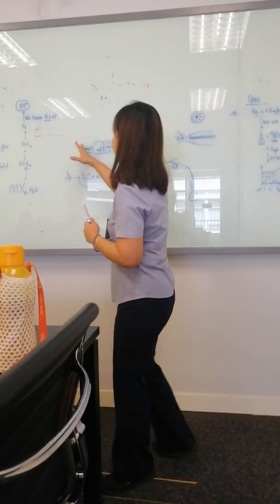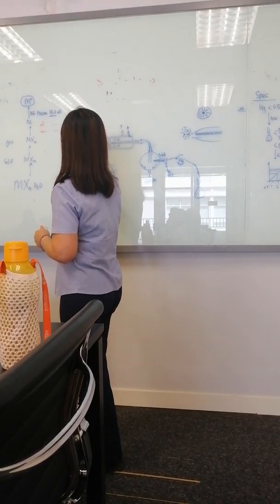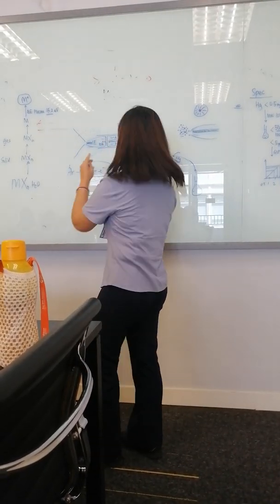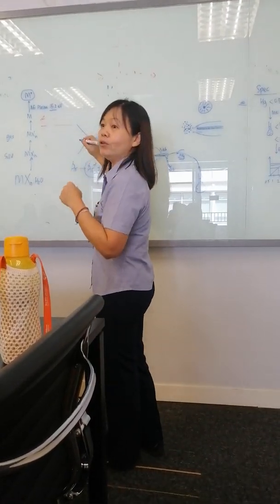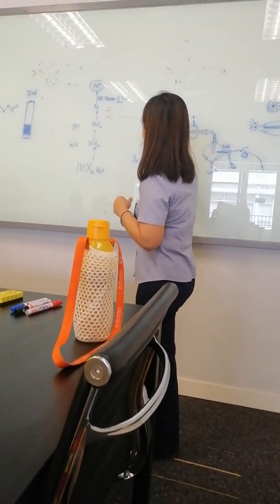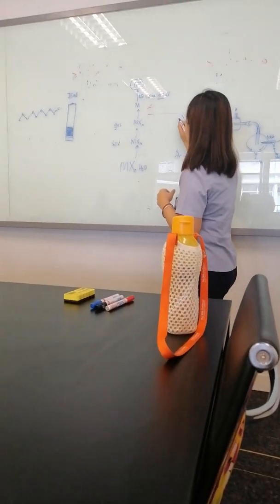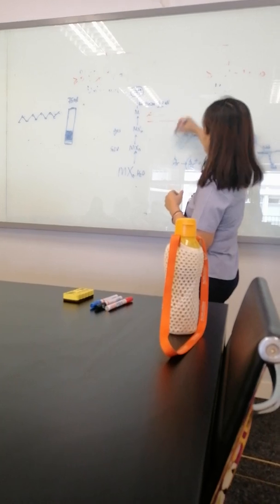Okay? So now I just told you the sample introduction. So by right, after this is your gate. So this is your, kita belum lap lagi, tadi kita cuci sample introduction. Nanti we go to the ICP, we are going to lap the cone, we are going to cuci the sample cone. Then we are going to cuci another cone, the skimmer cone. Then another cone, actually the hyper skimmer cone, right? So this is all the sample introduction.